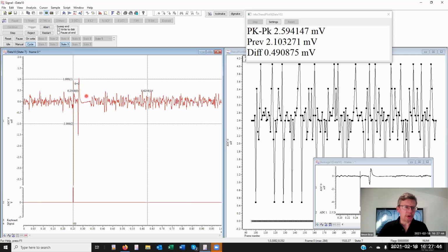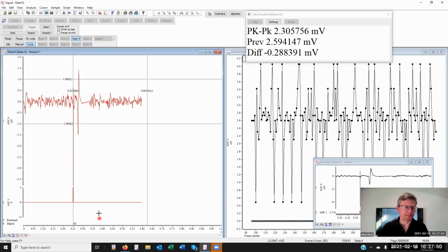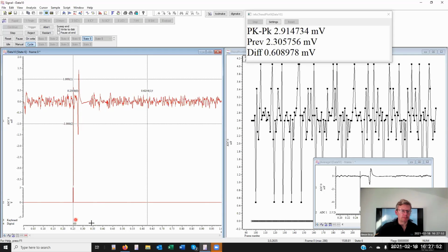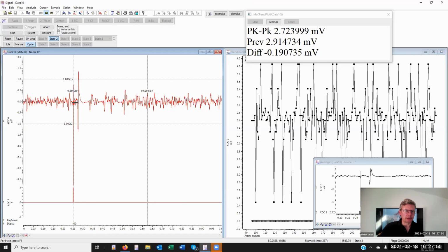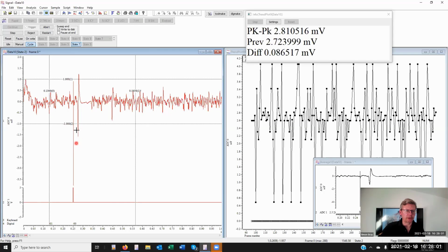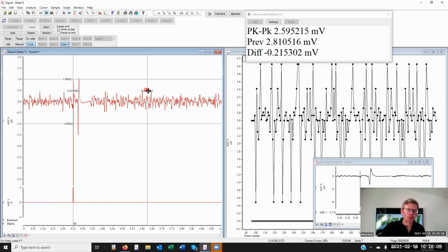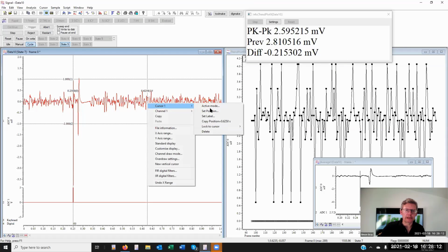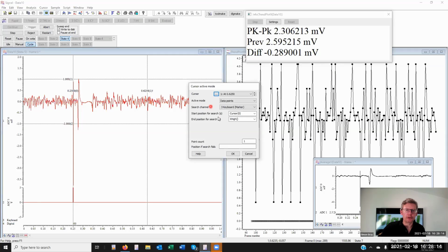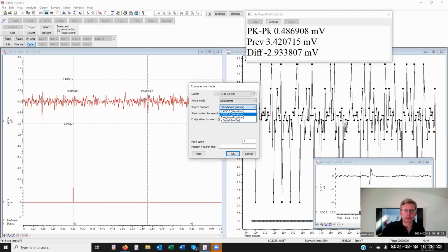Yes, cursors. So we've got cursor 0 jumping to the data points on the digital channel. Now, when we see a frame which has more than one digital marker, you should see cursor 0 step a little bit. Too quick, really. Right, so it's moving. At least you can see it's jumped to the first marker there. There again, it's moved. Now, cursor 1 moved as well, and that's because it's set up in an active mode to find keyboard markers. So it must have failed its search because there were no keyboard markers.